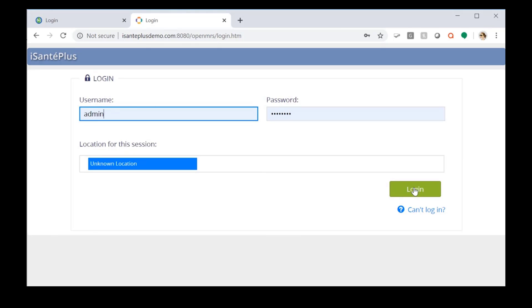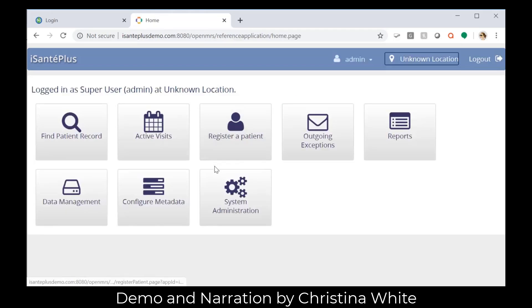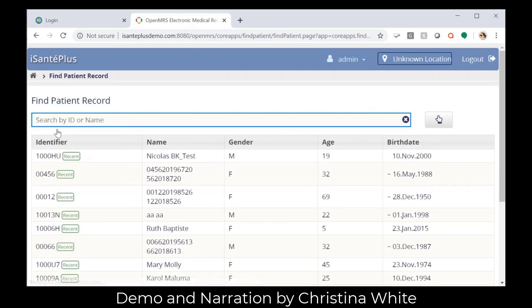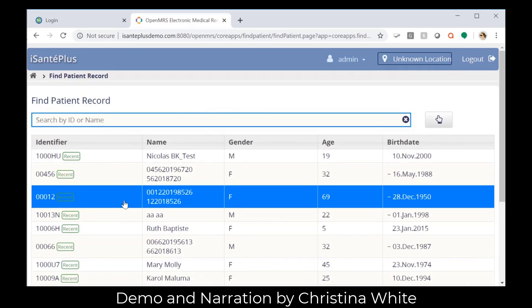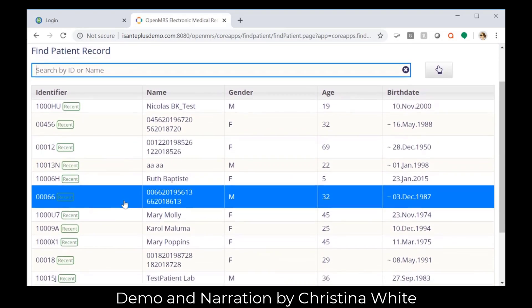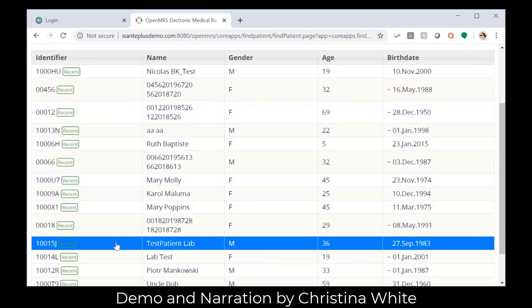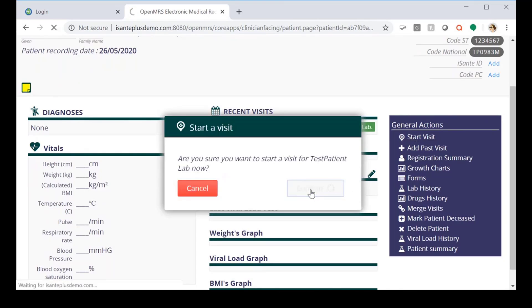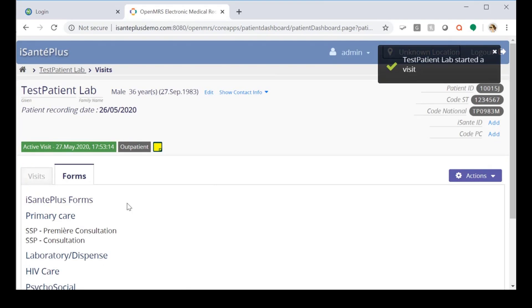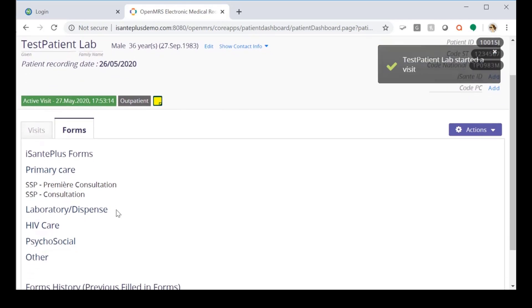First, we'll log into eSante Plus and we'll locate a lab test patient. We're going to start a visit and then open a laboratory analysis form.